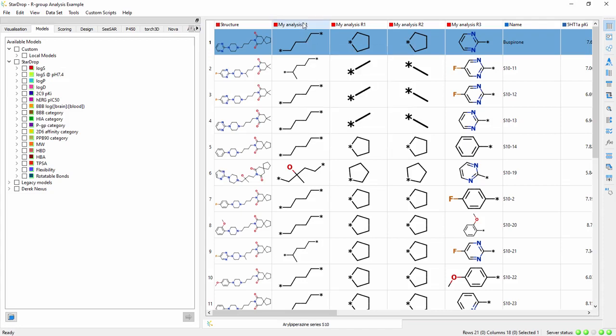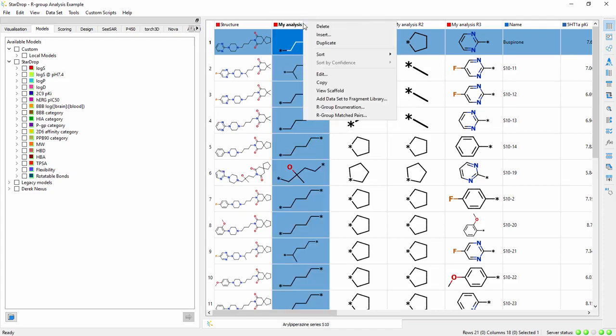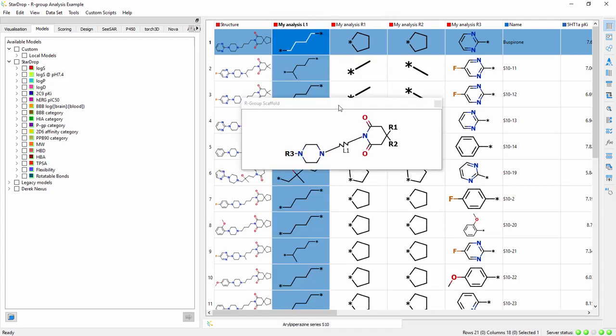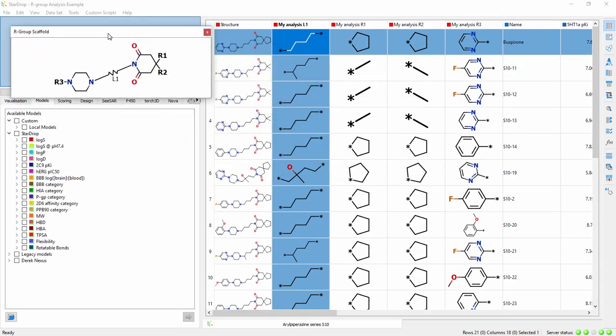And if you'd like to keep the template visible, you can create a separate window which can be docked within the StarDrop tabs.